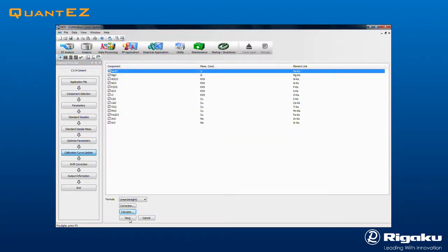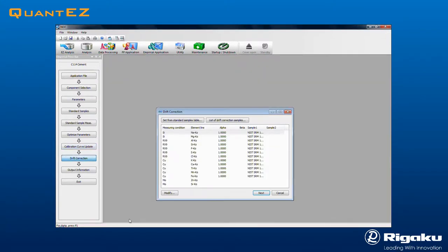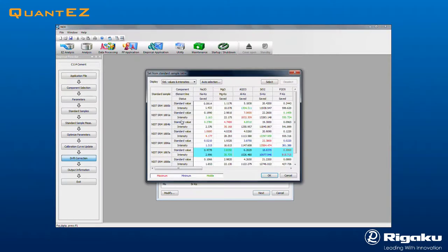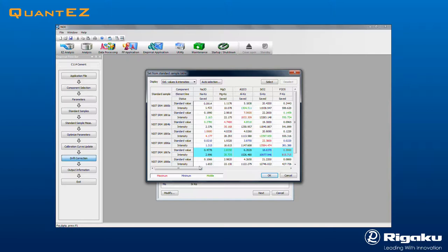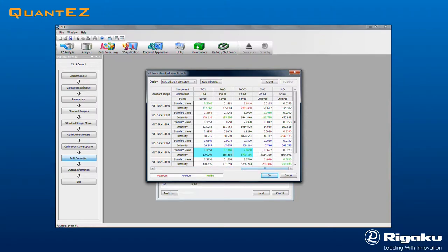Clicking Next brings up the Drift Correction screen, where a drift monitor may be easily selected from a list of calibration standards. In this example, NIST SRM1887A is employed. Select each component to enable, then click OK to exit.